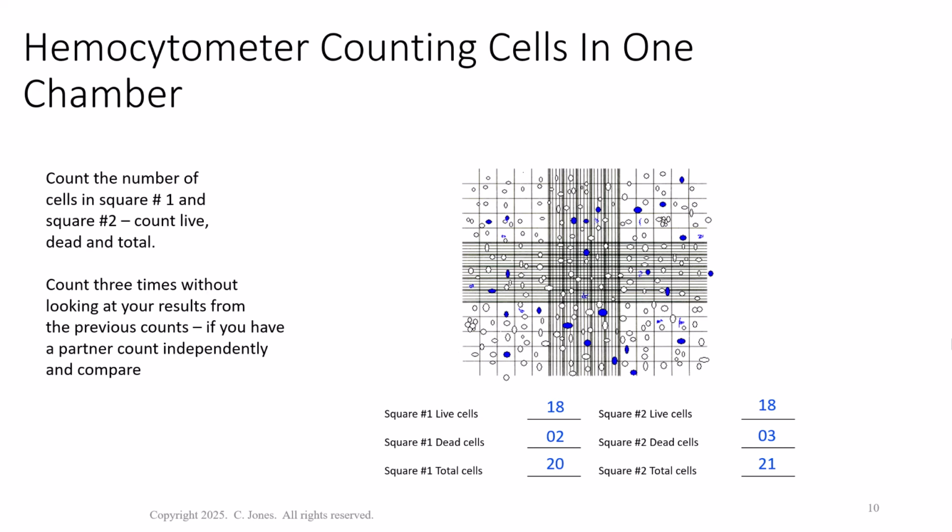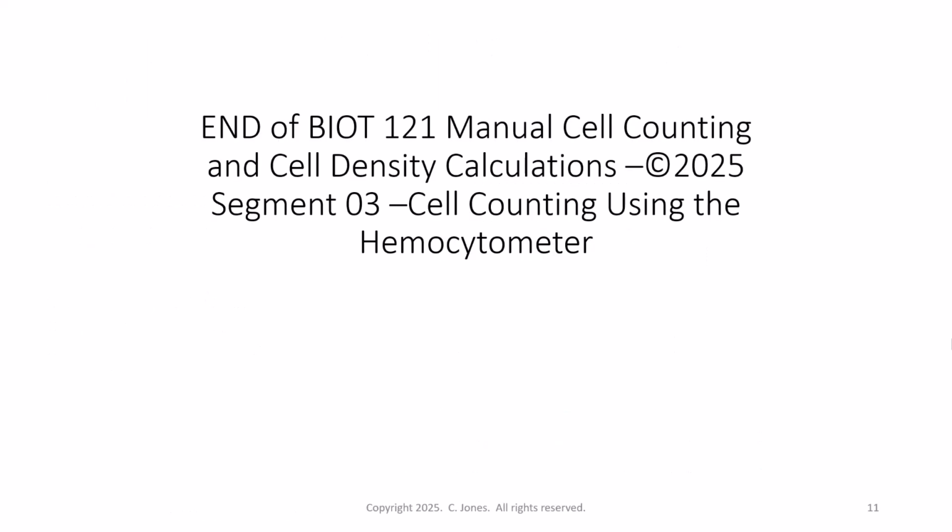Okay, so from here, we've learned how to count the cells, we've learned how to get the numbers. The next segments will deal with calculating the cell density, the cell viability, and seeding, how to do seedings. So that's the end of segment 3.